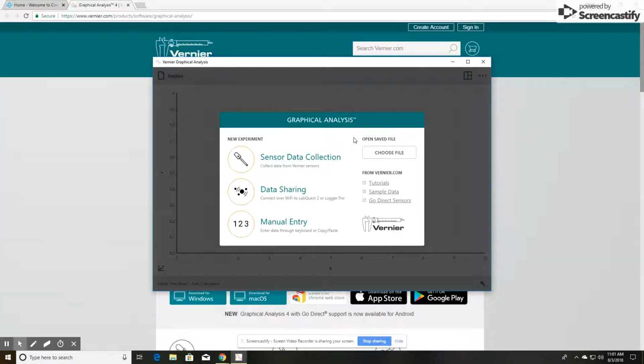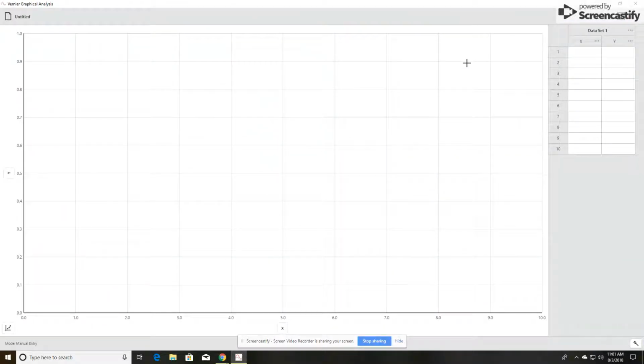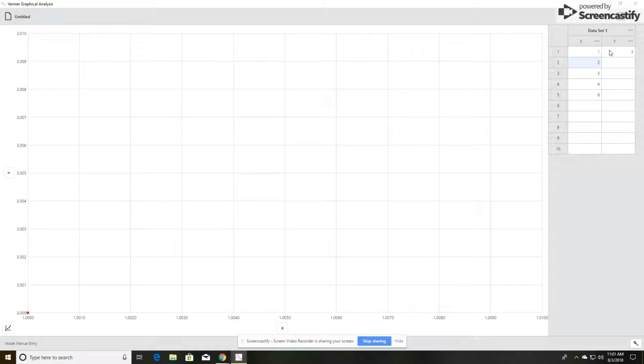For what I'm doing now, I'm just going to do manual entry. So I'm just going to make up some numbers here that we'll just add. So we'll do 1, 2, 3, 4, and 6. Then for the Y, I'll just make something up, 3, 6.